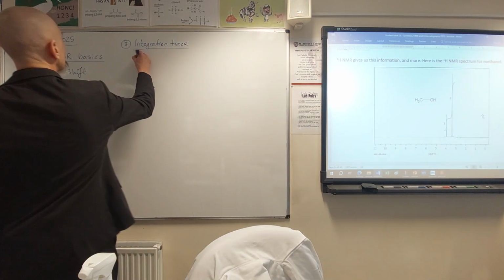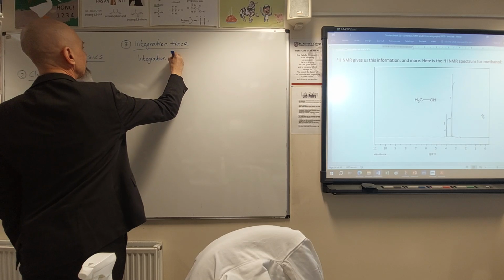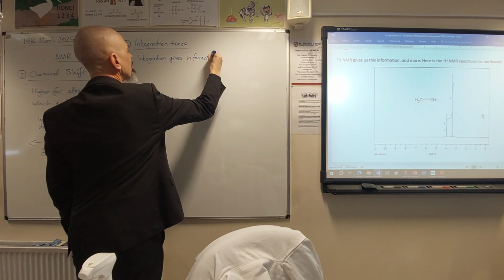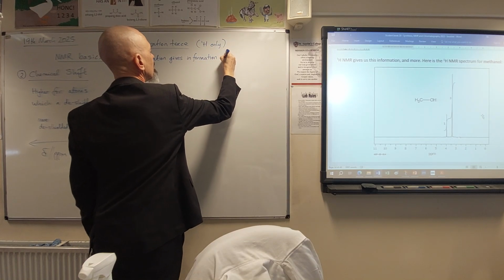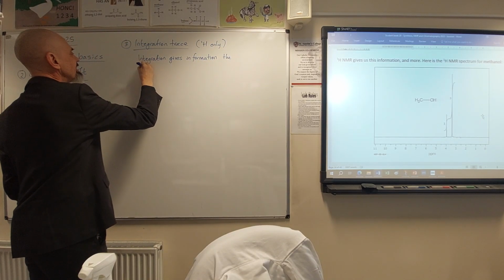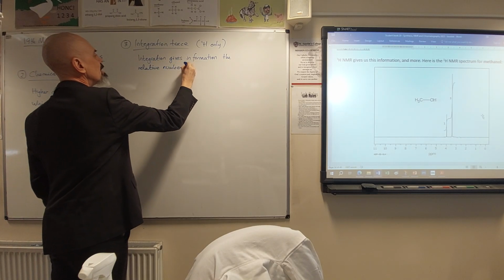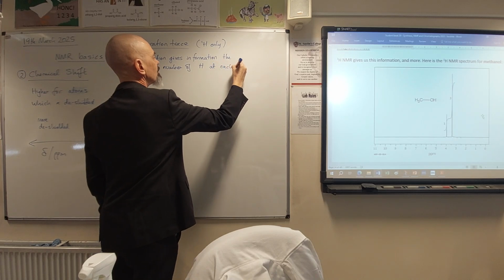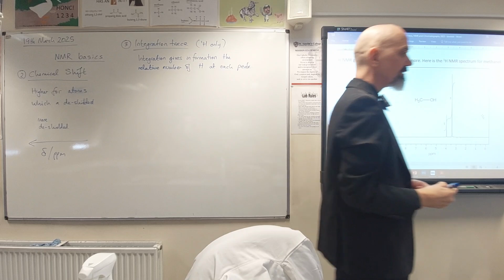So integration gives information about, and this is proton only, the relative number of protons at each peak. Relative number of hydrogens at each peak.